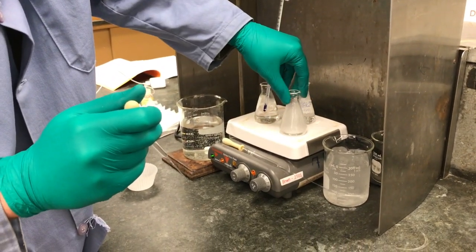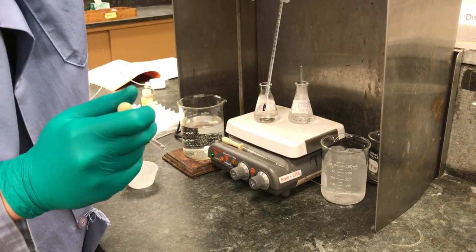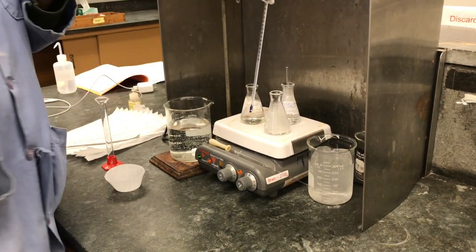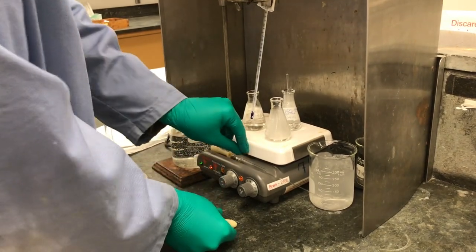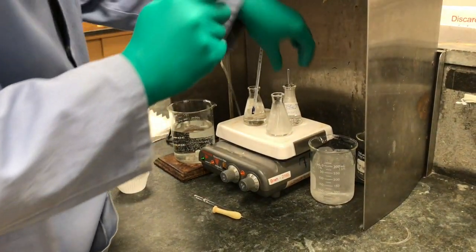I'm going to heat this just a little bit longer. Make sure it stays warm. See if it all dissolves. Okay. So it took about 2 pipettes. A pipette is approximately 1 to 1.5 milliliters. So it took probably about 2 to 3 milliliters of ethanol to dissolve.